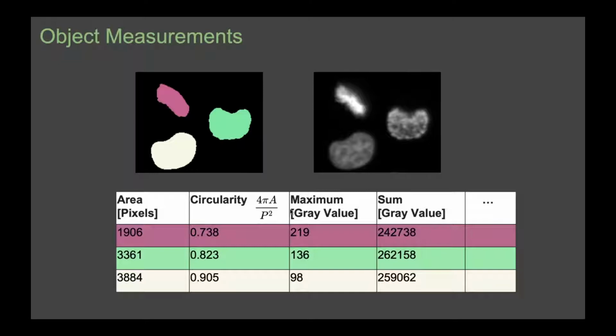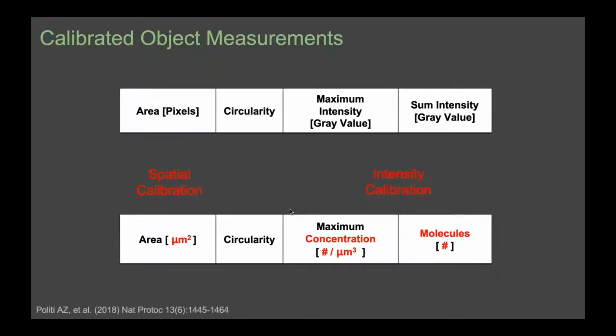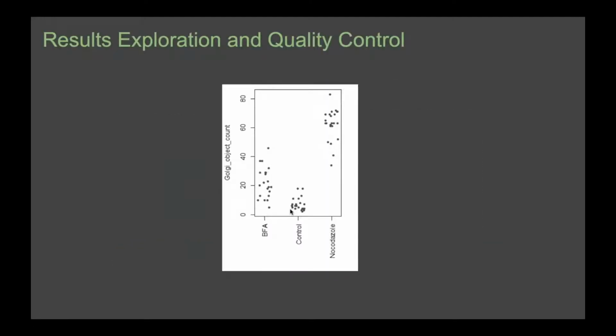Okay. How many images should I analyze per one data point on a plot to be sure my analysis was thorough? The answer is until your t-test becomes significant. So you can't know before. Basically, what you want is to have a statistical significance.